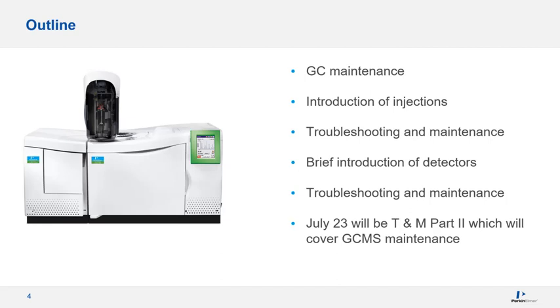Today we will discuss troubleshooting and maintenance. Over the past three decades, this topic has by far been the most popular. Since it is too much information to squeeze into one webinar, we have broken this topic into two. I will be discussing GC troubleshooting and maintenance today, and Lehman will cover troubleshooting and maintenance of GC-MS on July 23rd.